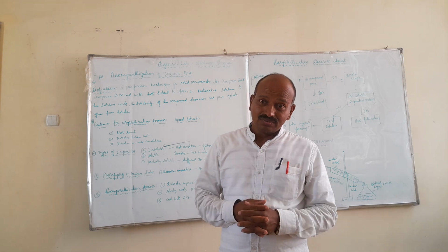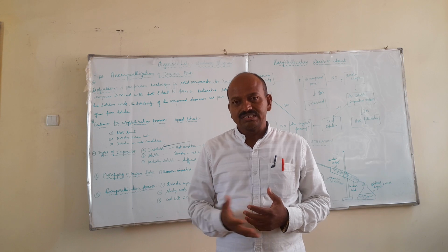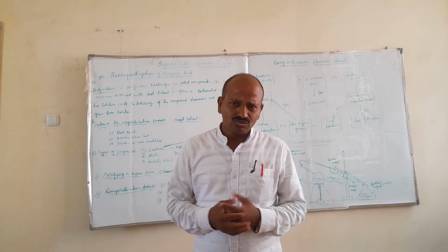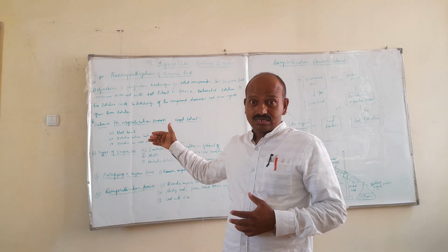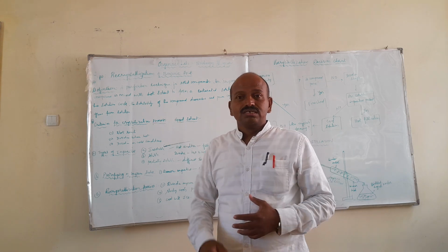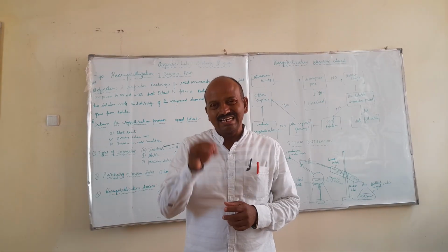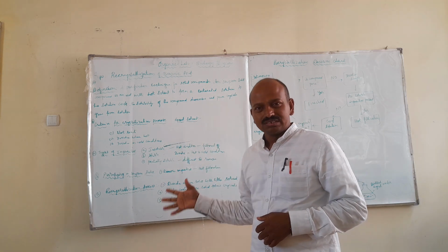What is crystallization? Many organic compounds are in liquid form, and sometimes they are in crystalline form, solid in nature. We are discussing the recrystallization of solid substances. Benzoic acid is a solid, a crystalline compound actually, yet it still contains some impurities. How do we purify benzoic acid containing impurities? This is the basic level of experimentation for organic chemistry students.